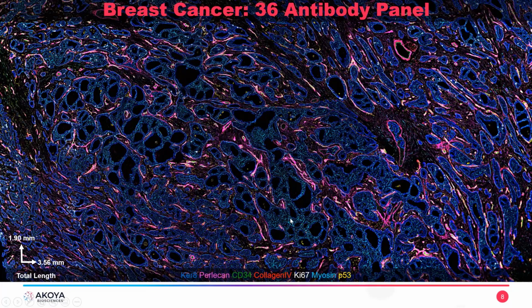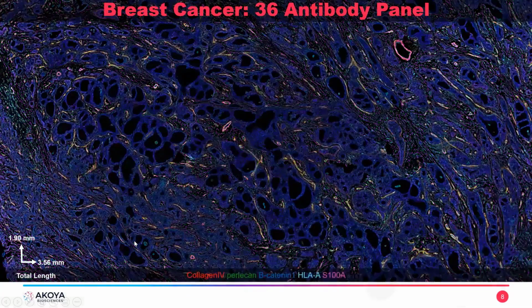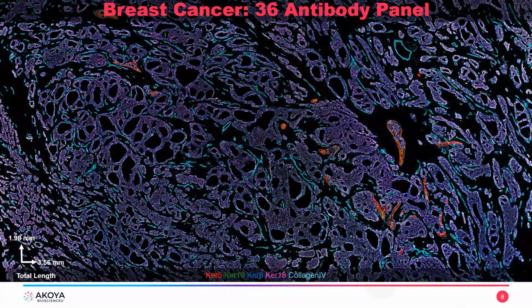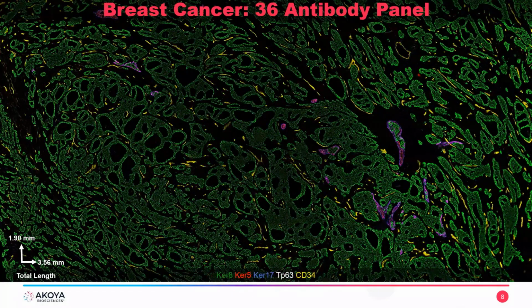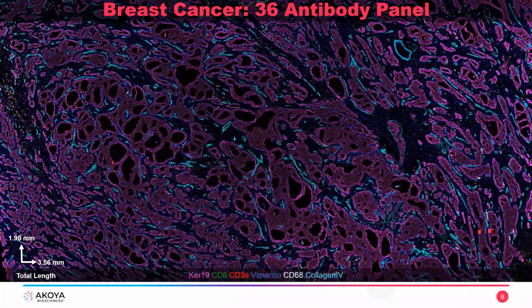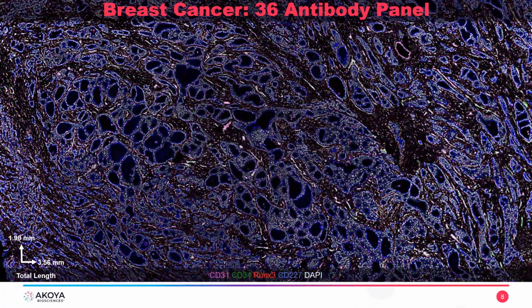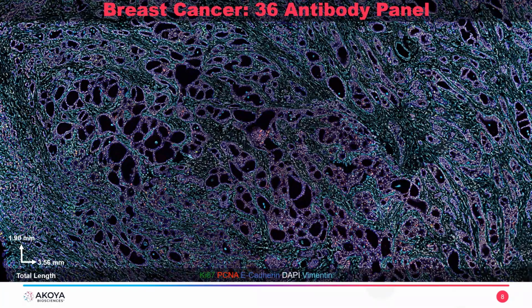It is a very revealing image. It's aesthetically pleasing, and it's data rich. Now I'm toggled over to 5 other antibodies. This is the exact same tissue with an additional 5 antibodies. Here are 5 more. I'm going to continue on until we've seen all 36 antibodies. I would just like you to appreciate not only how beautiful this is, but how much data are contained in this series of images. It is overwhelming in some sense.